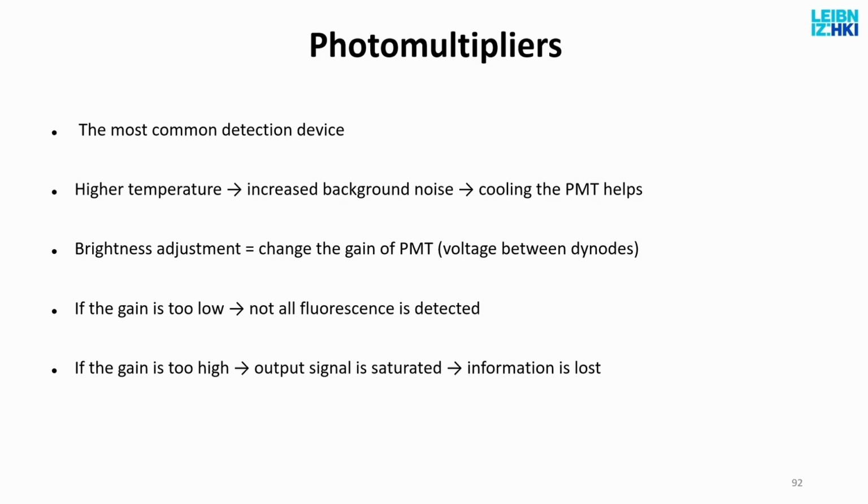The second reason for that, namely, is that the beam moves. Because as I scan the sample, the light beam that hits the sample moves left to right in a line. But this also means that the emitted light could also move. But we cannot have that. We cannot have the emitted light move across. So what we do is so-called descanning.